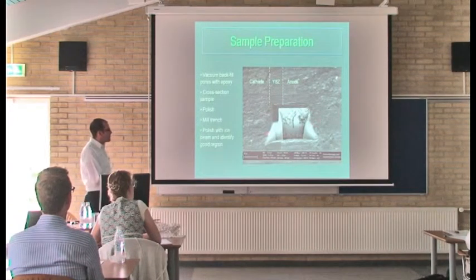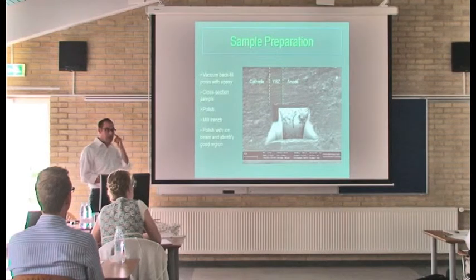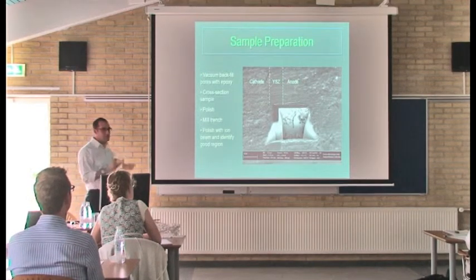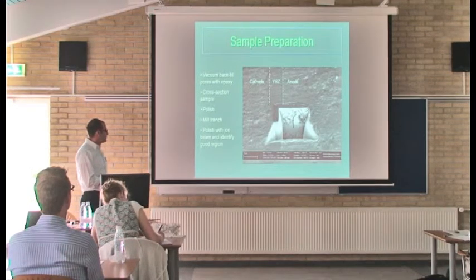The idea is to mill it out large enough that the redeposition on these sidewalls doesn't infringe on the area of interest that you're looking at. There are different geometries for this. I think we saw earlier you can do a horseshoe mill. But as long as you can avoid losing your view, either of these works quite well.